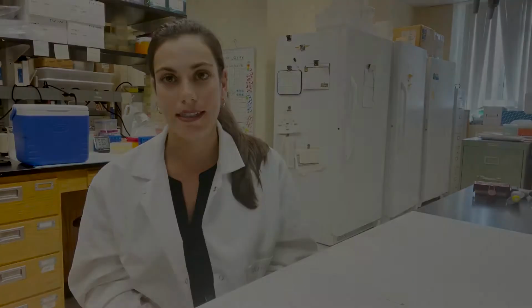Okay, so first off, what is ddRADseq? Well, it stands for Double Digest Restriction Site Associated DNA Sequencing. Okay, that's a mouthful, but there's a lot of really important information in the title. And essentially what it's referring to is that we are using two specific enzymes to reduce the size and the complexity of the genomic DNA.